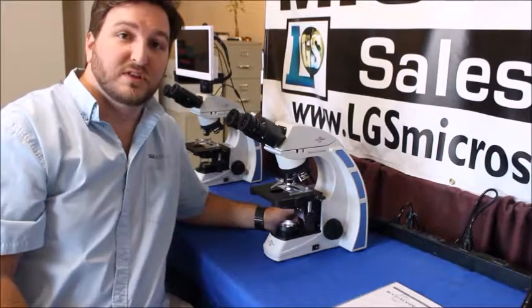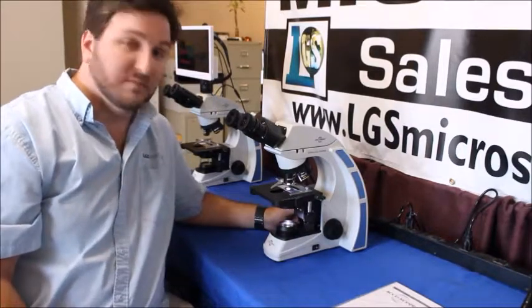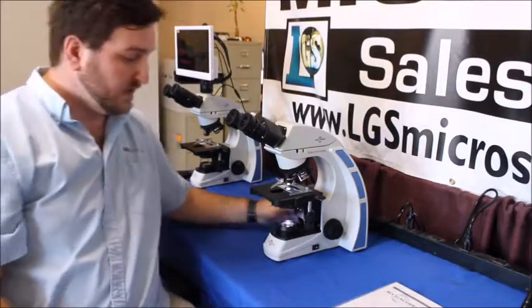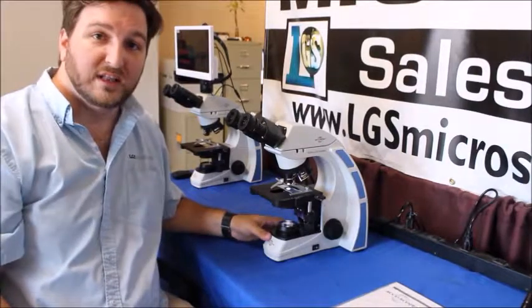This model is the AccuScope 3000 LED. LED bulbs tend to last a lot longer and you get a much truer color with this white light here.